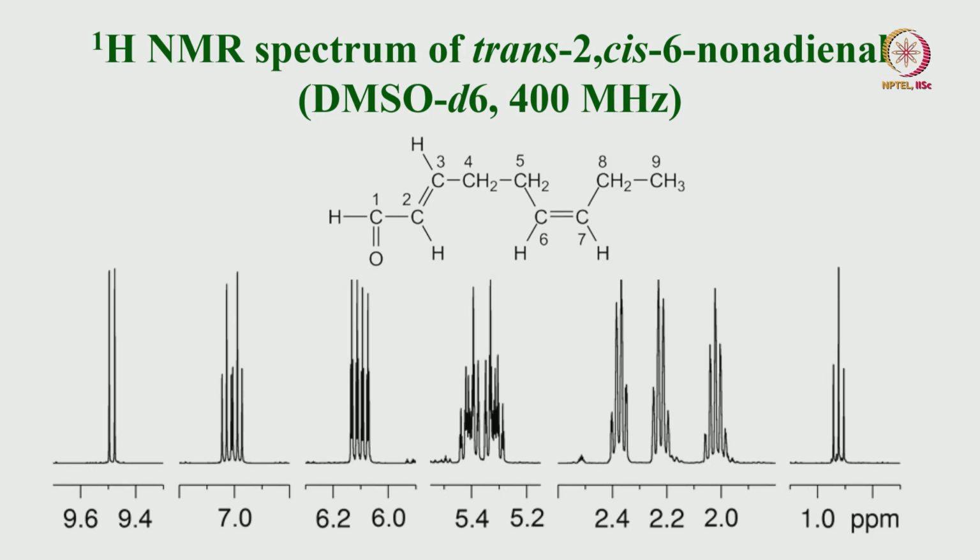This is the molecule, a very interesting molecule. There is no phenyl group here. When there is no phenyl group and only aliphatic groups like this, the spectrum is very difficult to analyze to extract information, but easy to make the assignment of protons. But if you want to analyze and get the J coupling, it is not easy. It takes a lot of time. More involvement is required.